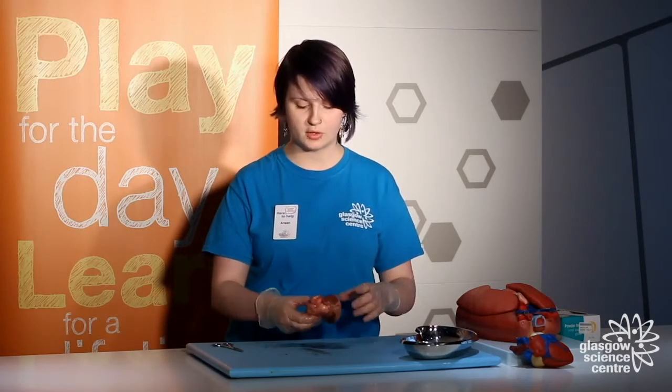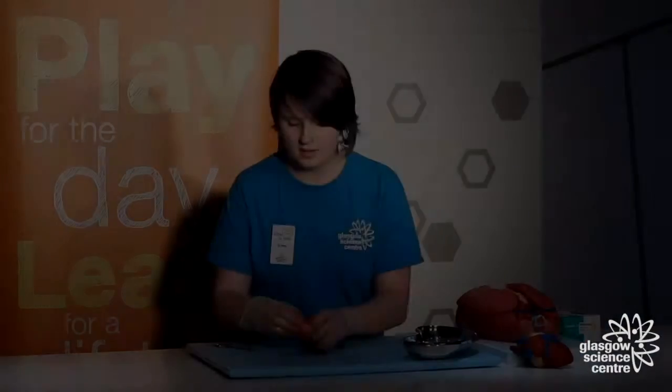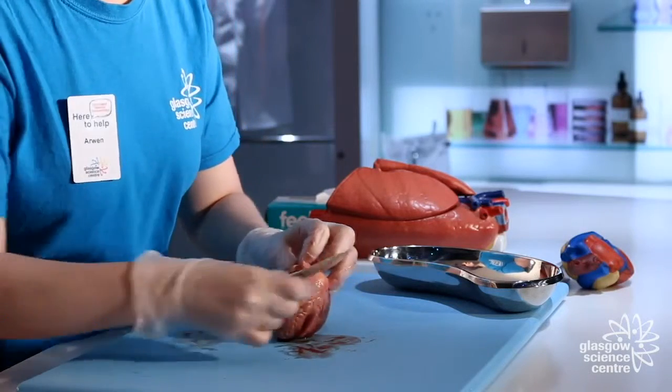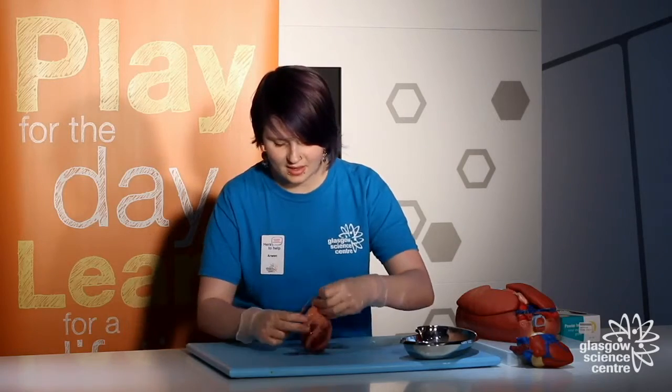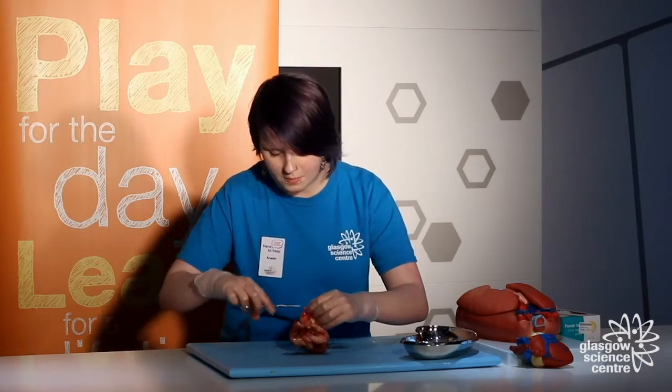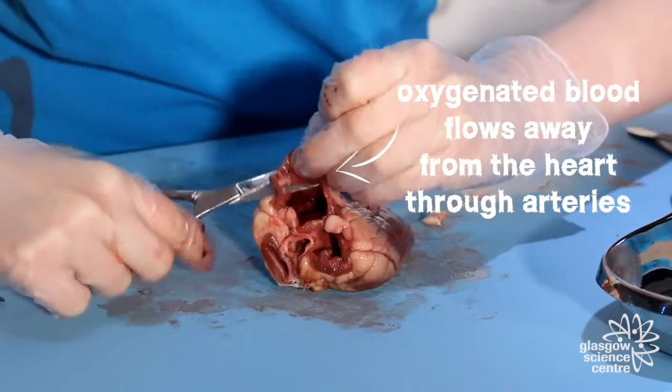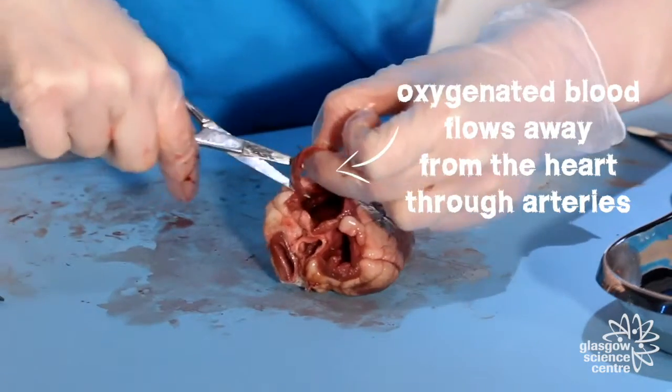So let's get started and have a closer look at the heart. Here we have our arteries — these are where blood goes away from the heart. I'm going to cut away from them and try to separate them apart.